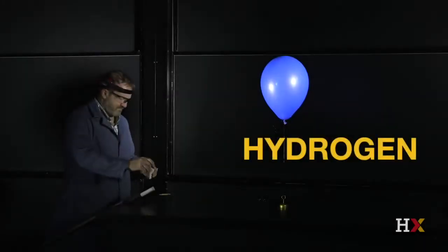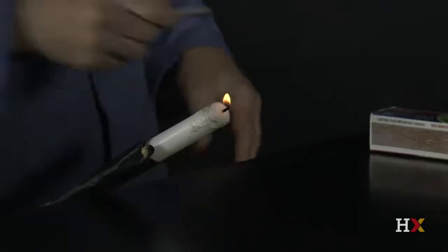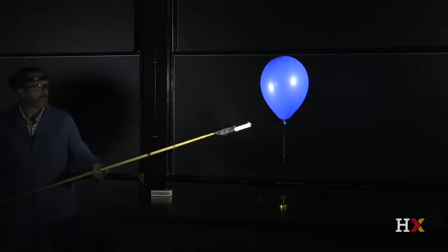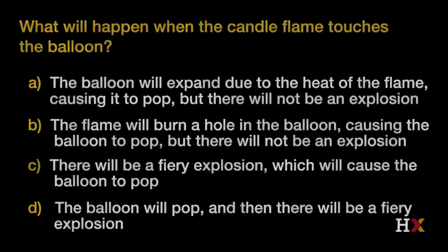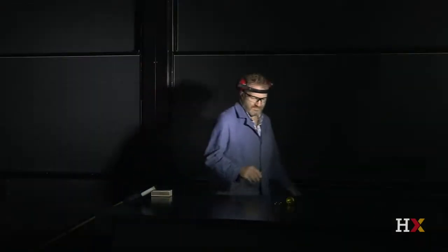Now let's consider a balloon filled with hydrogen gas. Let's see what happens when we touch the flame to the blue hydrogen-filled balloon. What do you think will happen? This time, when the flame touches the balloon, it pops open with a very loud sound, the flame is blown out, and the gas ignites, producing a fireball.